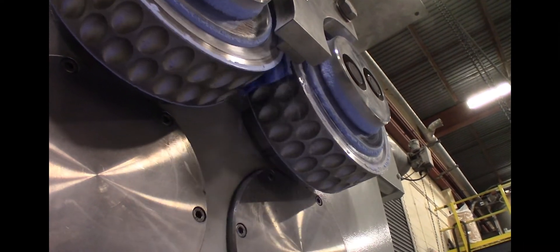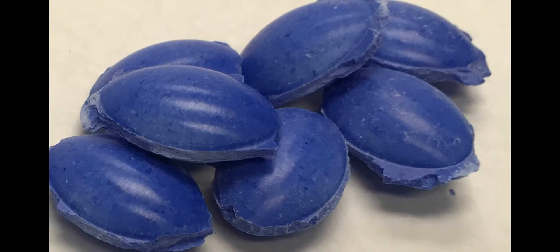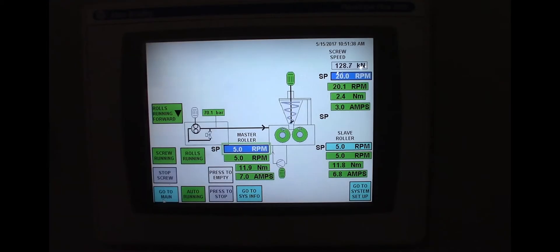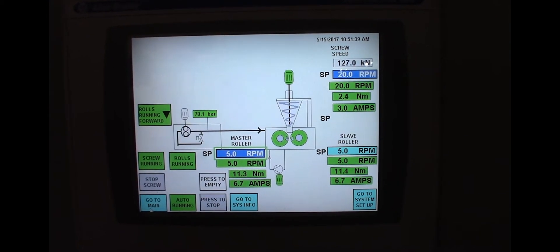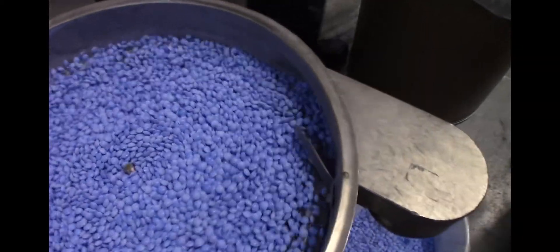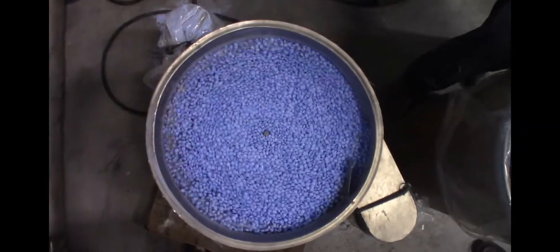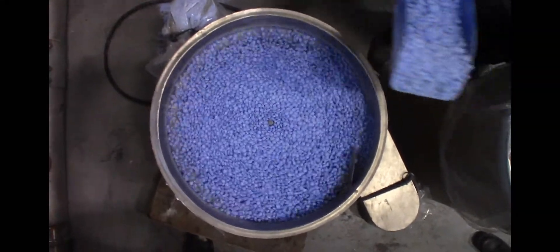The material remains pure and costs are low. Optimal results can be achieved by automatic adjustment of the press force, avoiding poorly formed or soft briquettes. Dust liberated from the briquettes is then screened and recycled back to the compactor.